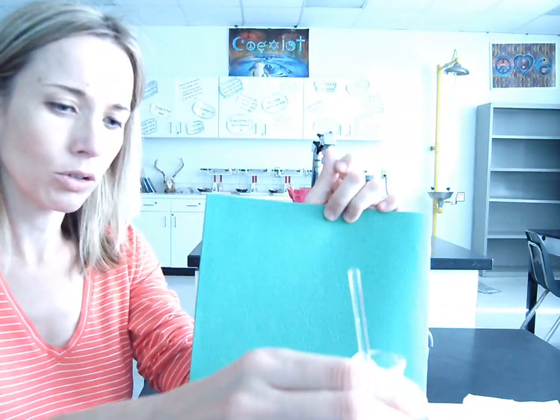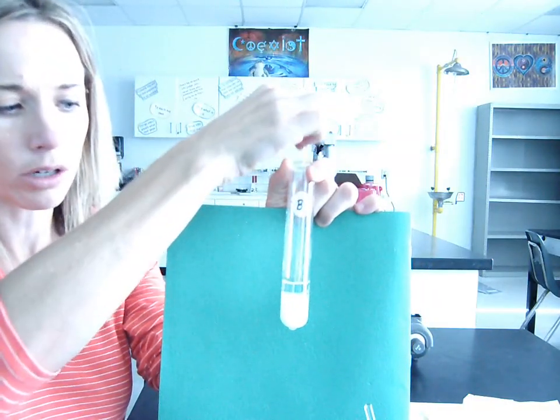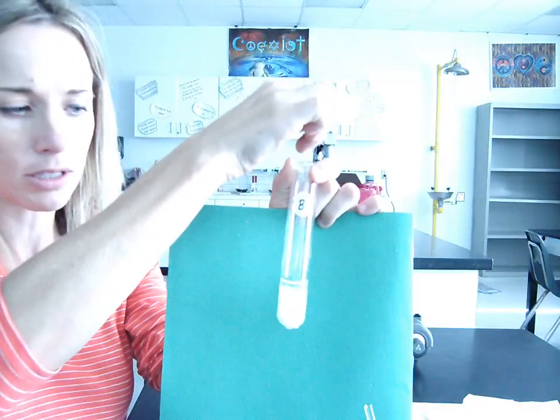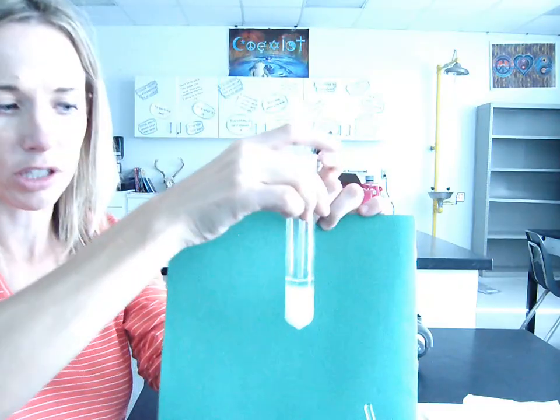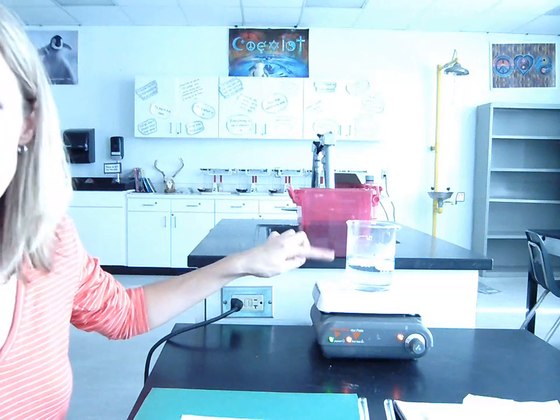Substance B is very similar. Substance B is also 10 cubic centimeters of water and 10 grams of substance. Also not very soluble at room temperature. Okay? So what we're going to do with these two test tubes is to heat them up to about the boiling point of water, about 100 degrees Celsius, and see if their solubility is affected by the temperature.